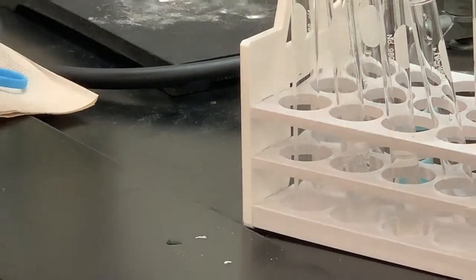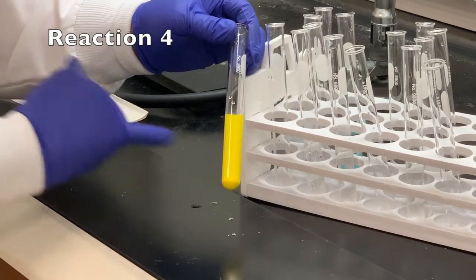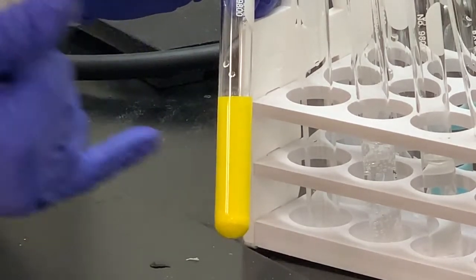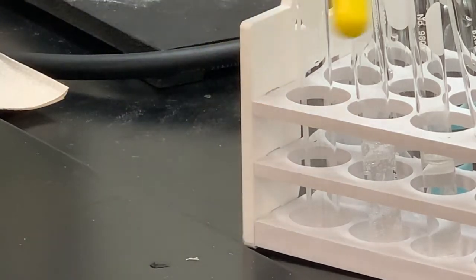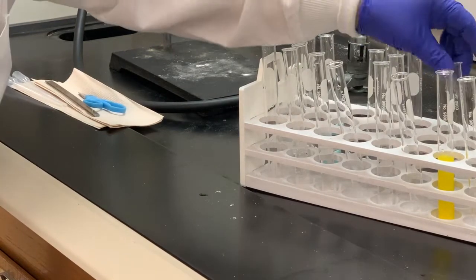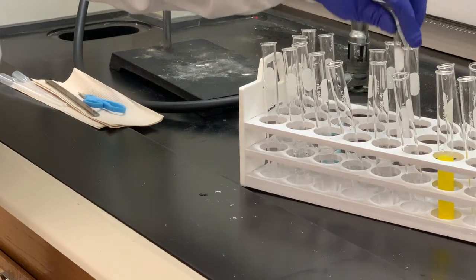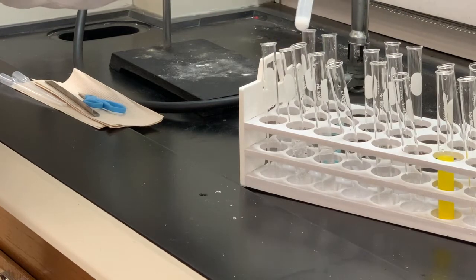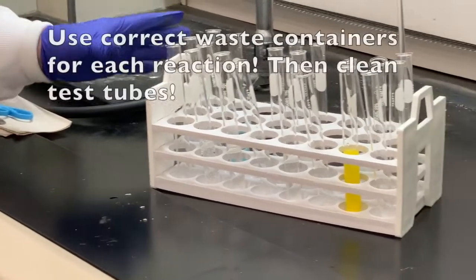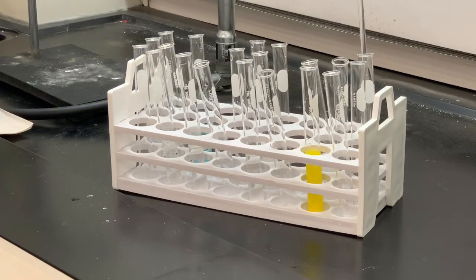So there's that one. I want to go back to it. It's not completely colorless, but if you look down at the bottom, you can see where it's more concentrated in that solid. Again, when all the solid comes down to the bottom, that liquid above would be that supernatant liquid. And just let me look at maybe one more. It hasn't settled yet, but I think you see the distance that it has traveled. Given time, they will all eventually fall down to the bottom. So again, at the end, we have to put these in appropriate waste containers and then clean up, and then experiment complete.